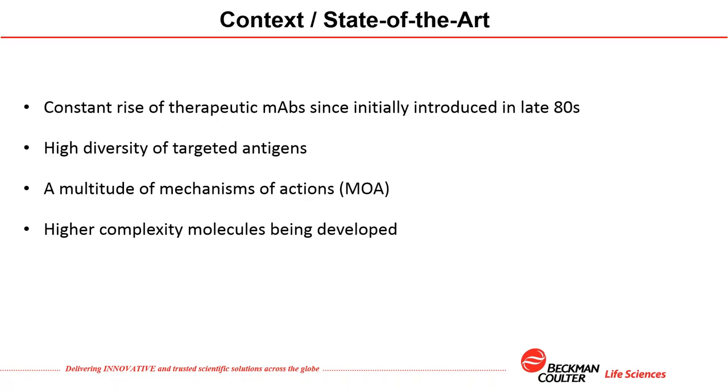So without spending much time on the introduction, I can state that we've been witnessing over the last few years a significant rise of therapeutics on the market, and there are many reasons for that, especially their efficacy. But what we can say, at least from our end, trying to develop approaches to characterize these molecules, is that a multitude of mechanisms of action are being made possible thanks to therapeutic antibodies.